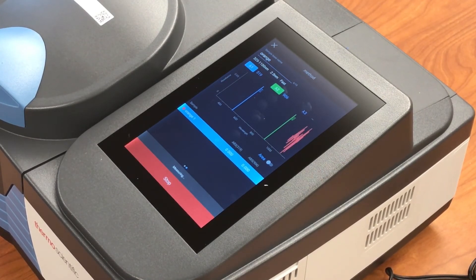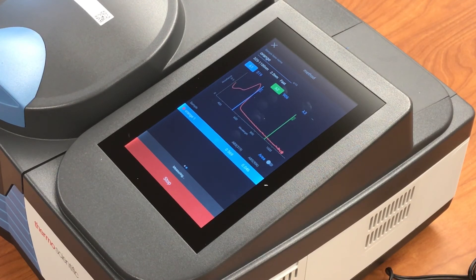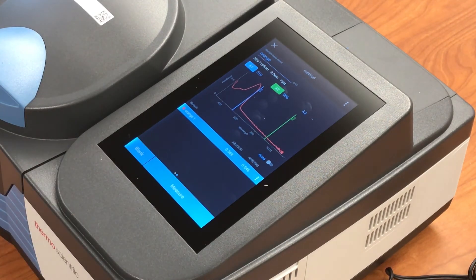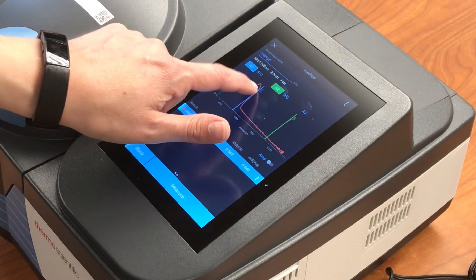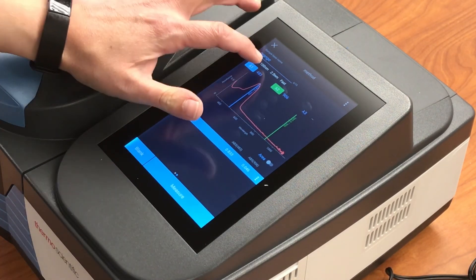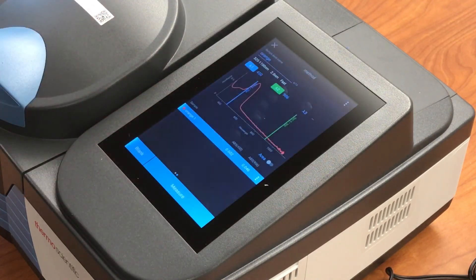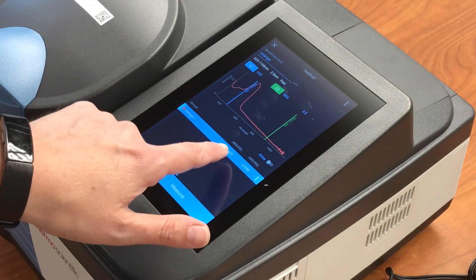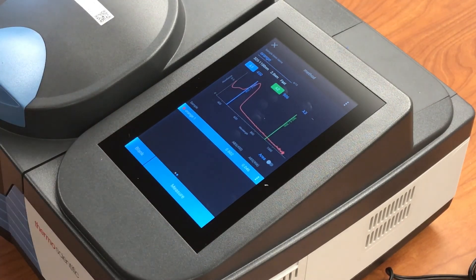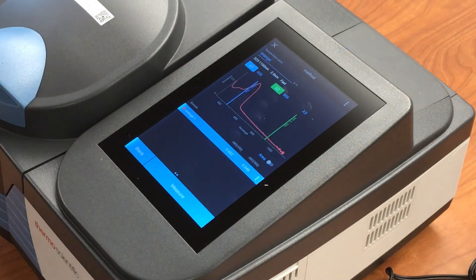The instrument will say measuring, and you can actually see the absorbance being collected at each wavelength. When complete, we can use the spectrum shown on the screen. You can slide these wavelength selectors around if you want to determine the peak maximum. You can also dial in — for example, if I wanted to look at the absorbance at 450 nanometers, it will tell you in the table below. The absorbance at 450 nanometers is 0.6 absorption units. There are three different wavelength options if you wanted to look at different peaks.